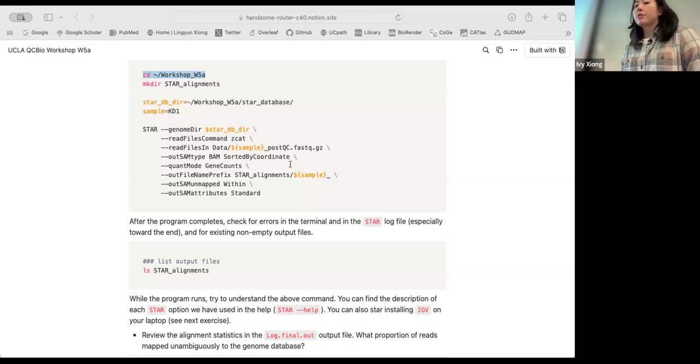For the alignment, I think we don't have that anymore. Let's move it over here. For the alignment, we have a couple of other parameters. So I guess if the indexing takes more memory, the alignment would be faster. Oh, those are individual tasks. It has nothing to do with each other. And you're not running in parallel, right?